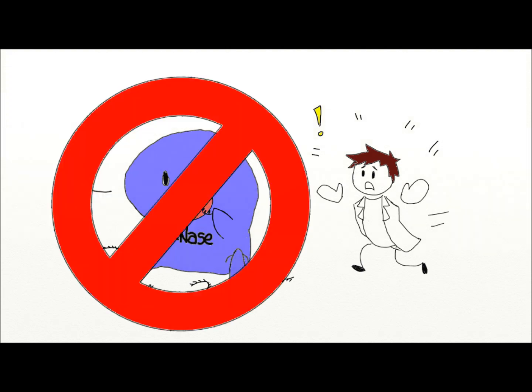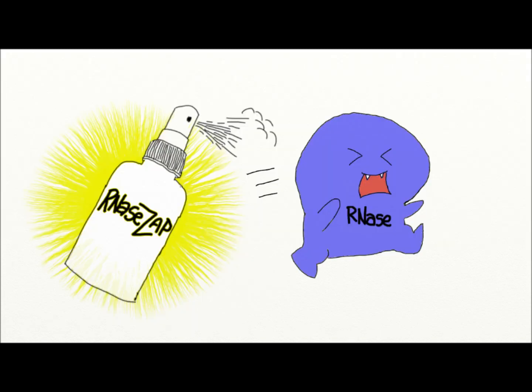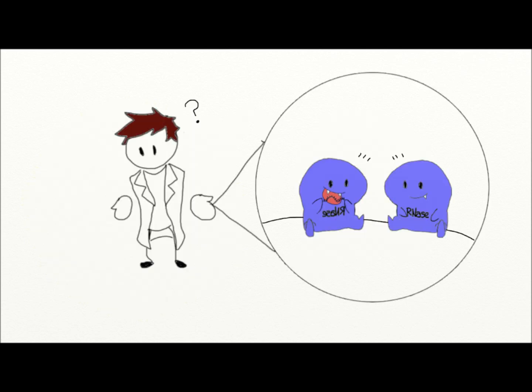To prevent this, any equipment used for RNA extraction has to be thoroughly cleaned with chemicals to destroy RNases. In addition, experimenters have to take special care to ensure their own skin RNases do not contaminate their own samples.